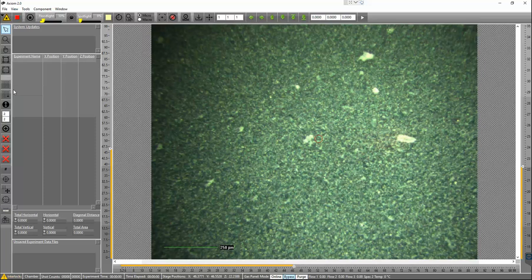What I'll do is place a spot in the upper left, and then place a spot in the lower right. What this does is orient the data collection to start from upper left and work towards lower right. Now you can see that this is default set up for 2 by 2, so 2 rows, 2 columns, the tooltips tell us. So I'm going to make this 3 by 3. And when I hit enter, now we have a grid of 9 spots.